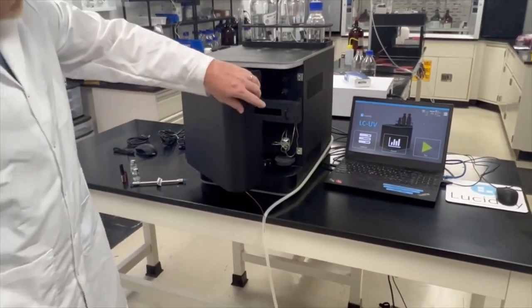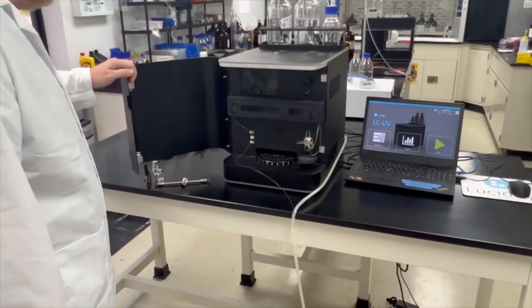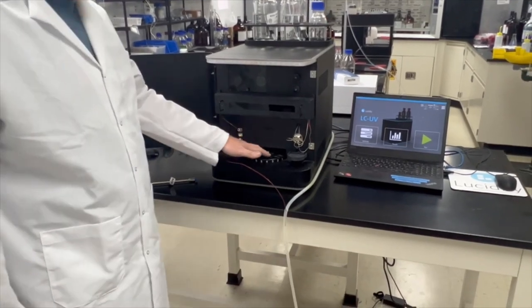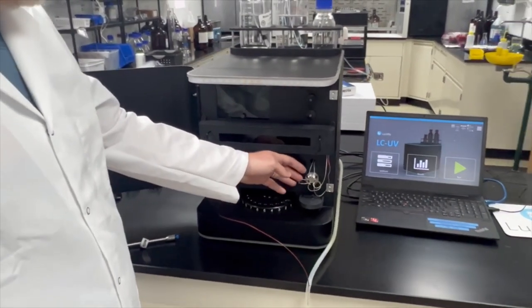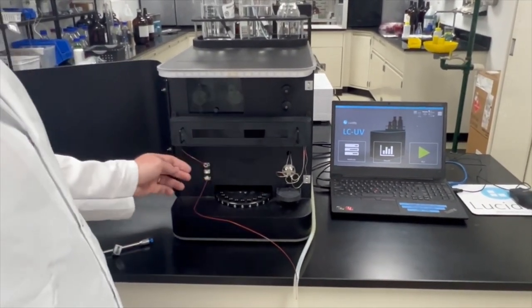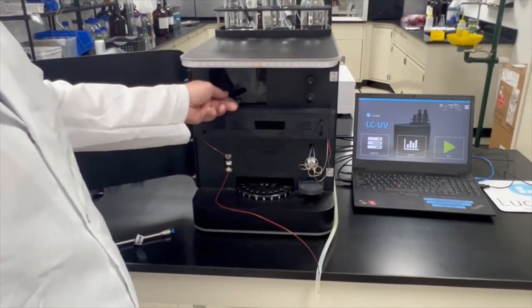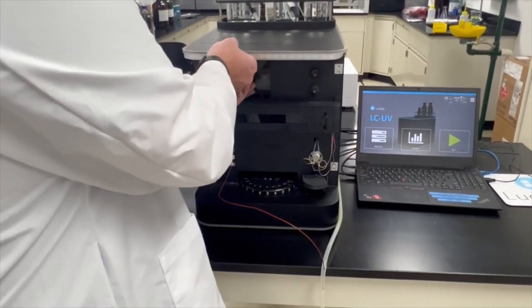We're going to open up the door and see what's inside. Inside you have your turntable, selection valve, flow cell, and a viewer for your pumps.